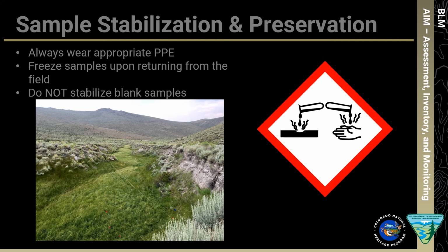Stabilize all samples except blank samples with concentrated sulfuric acid. Always store the sulfuric acid dropper in a Nalgene storage bottle containing baking soda when not in use. Ensuring that you are wearing proper PPE, including protective eyewear and nitrile gloves, carefully remove the dropper bottle cap, keeping clear of face. Invert and add 3 drops of sulfuric acid to the water quality sample. Seal the water sample and shake vigorously for 5 seconds.